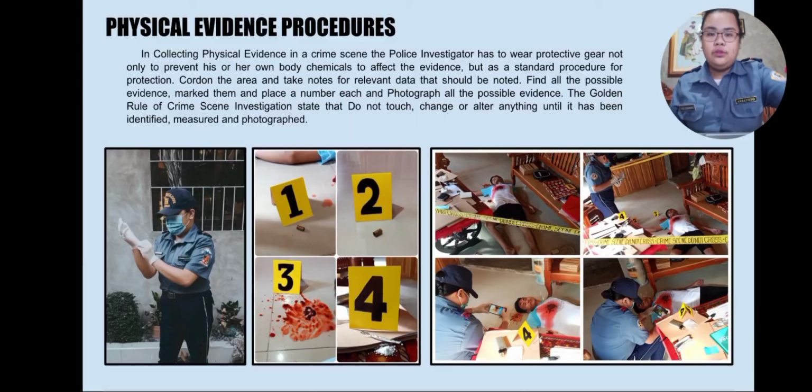So, let's proceed to the physical evidence procedures. In collecting physical evidence in a crime scene, the police investigator has to wear protective gear, not only to prevent his or her own body chemicals from affecting the evidence, but as a standard procedure of protection. So, dito daw po sa collecting physical evidence, kailangan daw po na yung police investigator is naka-proper gear. Nakasuot ng gloves or face mask para maiwasan makontaminate ang isang evidence.